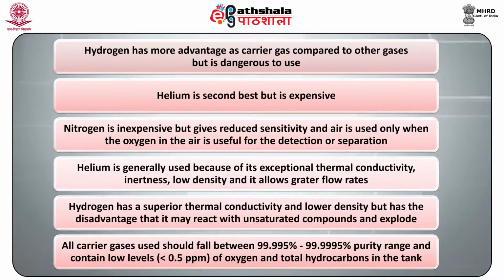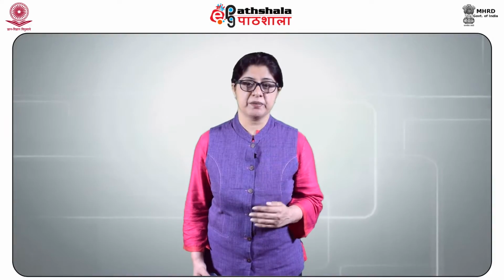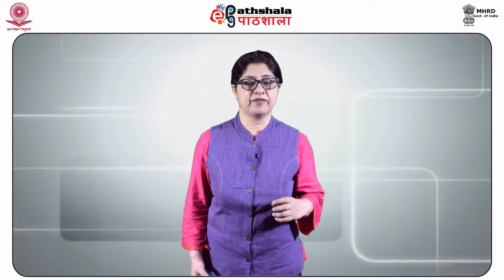Helium is generally used because of its exceptional thermal conductivity, inertness, low density, and it allows greater flow rates. Hydrogen has superior thermal conductivity and lower density, but has the disadvantage that it may react with unsaturated compounds and explode. All carrier gases should fall between 99.995% to 99.9995% purity range and contain low levels, even less than 0.5 ppm, of oxygen and total hydrocarbons in the tank. The carrier gas passes through a molecular sieve to remove water and other impurities. Traps are another option to remove traces of water and other contaminants. A two-step pressure regulation is required to minimize pressure surges and to monitor the flow rate of the gas.